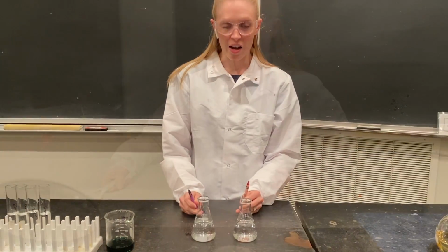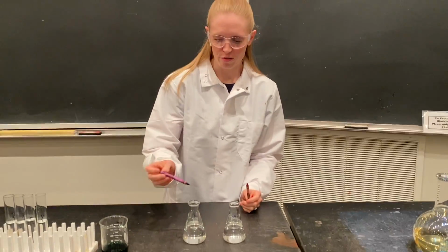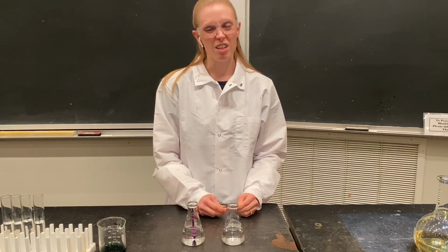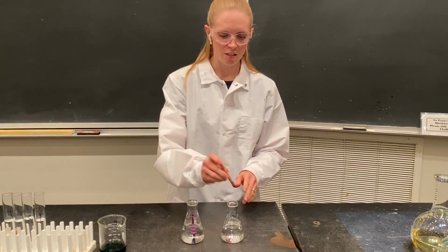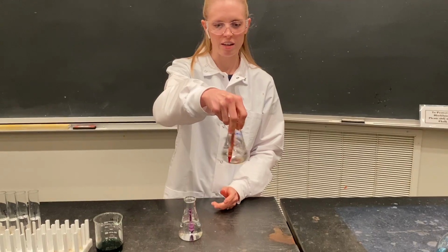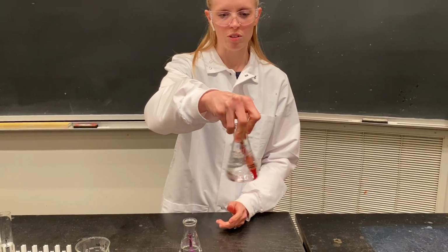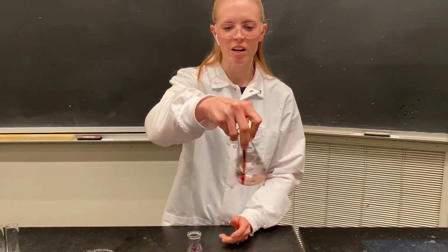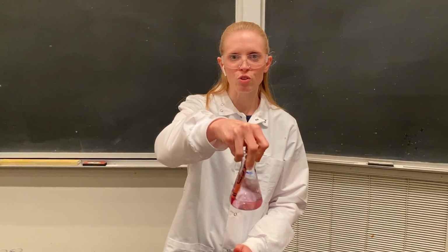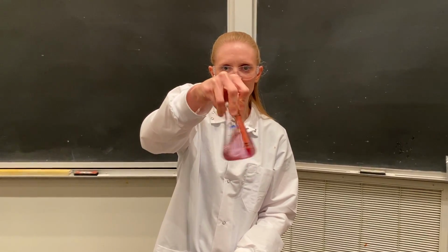Another thing that's nonpolar is crayon. If you've ever tried to wash off crayon from, say, a wall, you know it doesn't really work if you use water. You have to find something that's nonpolar to really get it to rinse off. Now this is going to take a while, but what I have in this beaker is hexane, and it's a nonpolar substance. So after a while, the crayon will start to dissolve because the molecules of the crayon are sticking to the molecules of the hexane. They're both nonpolar molecules and they're attracted to each other. And that's why things stick together. Molecules attracting.